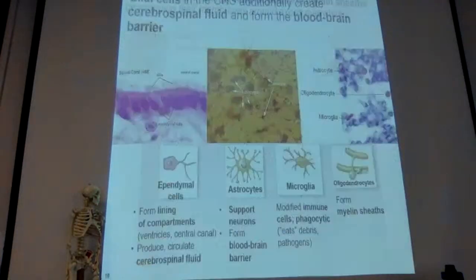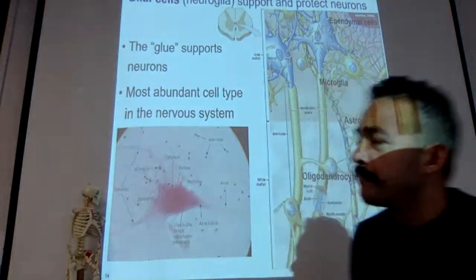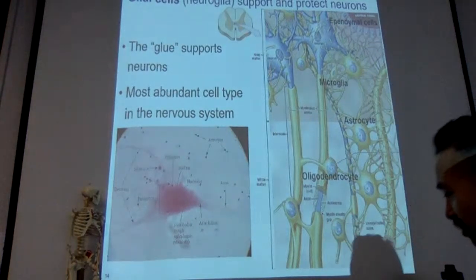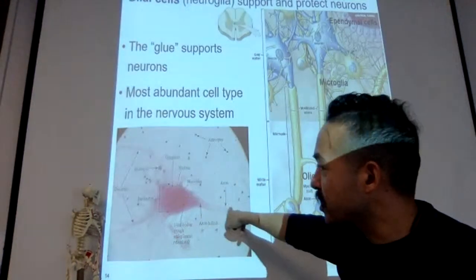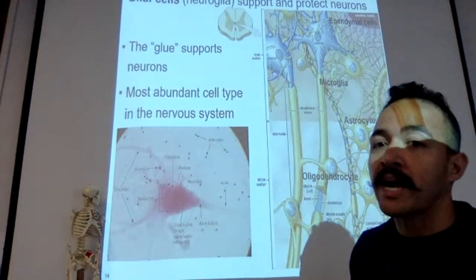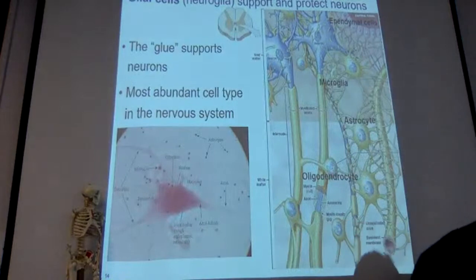Okay, we talked about glial cells. We started on slide 14. When we look at histology, neurons are typically very large, very big and branched. You see nuclei surrounding them, those are some kind of glial cell. So it's about narrowing down which glial cell we are looking at, because there are a lot of different kinds and they do different things.